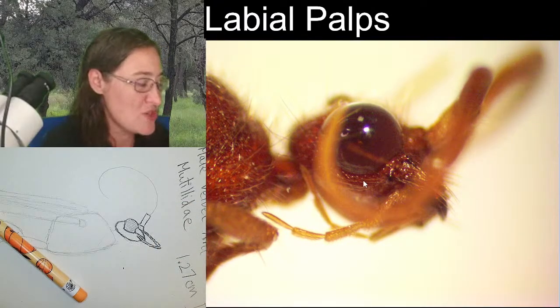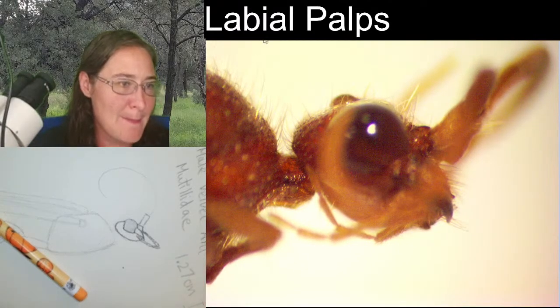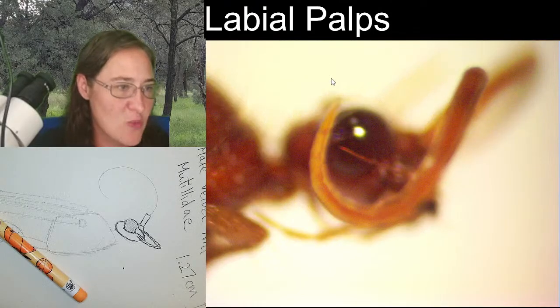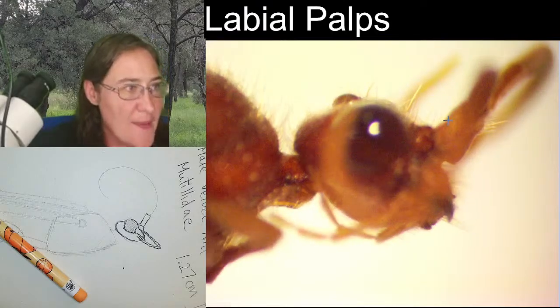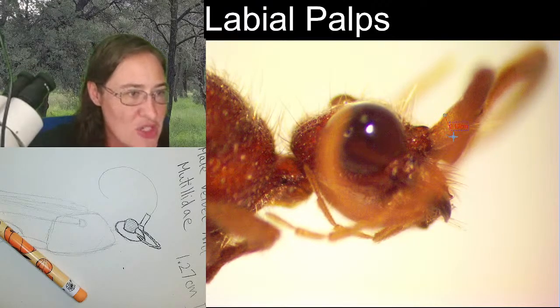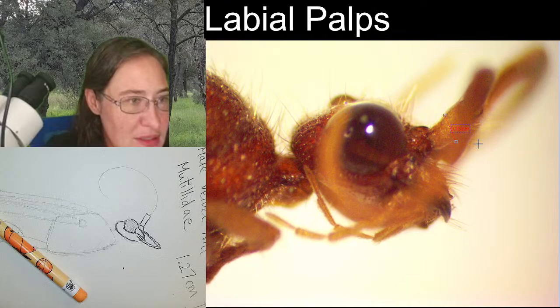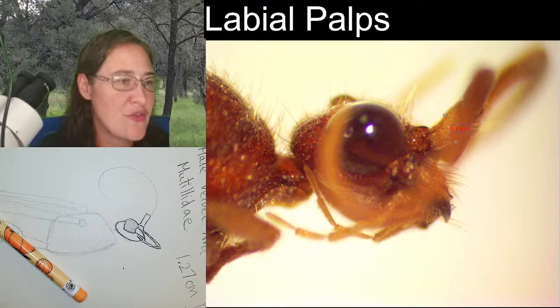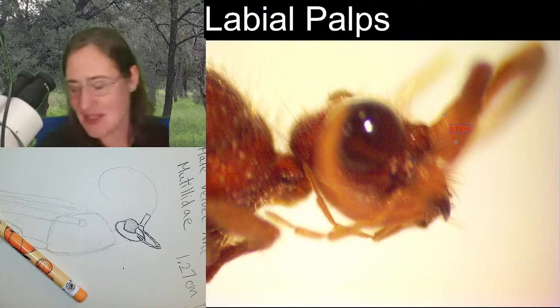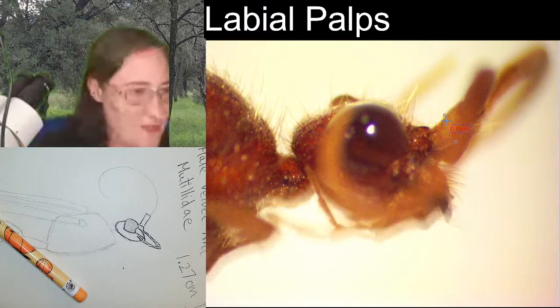your antenna. But I do believe that this first segment of the antenna is wider than all of the other segments. So if I get the measurement of the width of the first segment, yeah, it's more like 0.15. That's a fascinating number. Is that really right? We're gonna try that one more time. No, that's right.